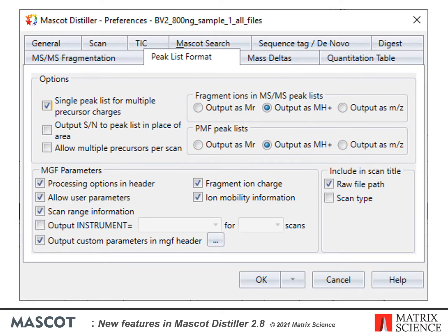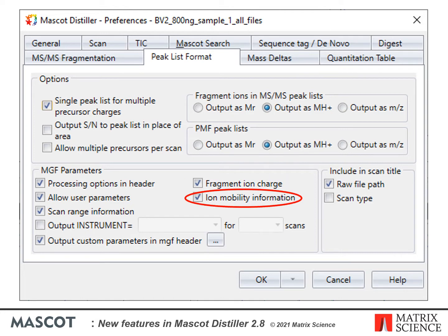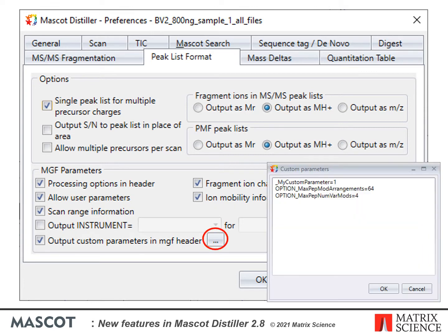If you want to use any of these settings, go to Tools > Preferences in Mascot Distiller and select the peak list format tab. Here you'll find the checkboxes for enabling the output of fragment ion charges and precursor ion mobility values, and also where you can add your own custom values to the MGF header.